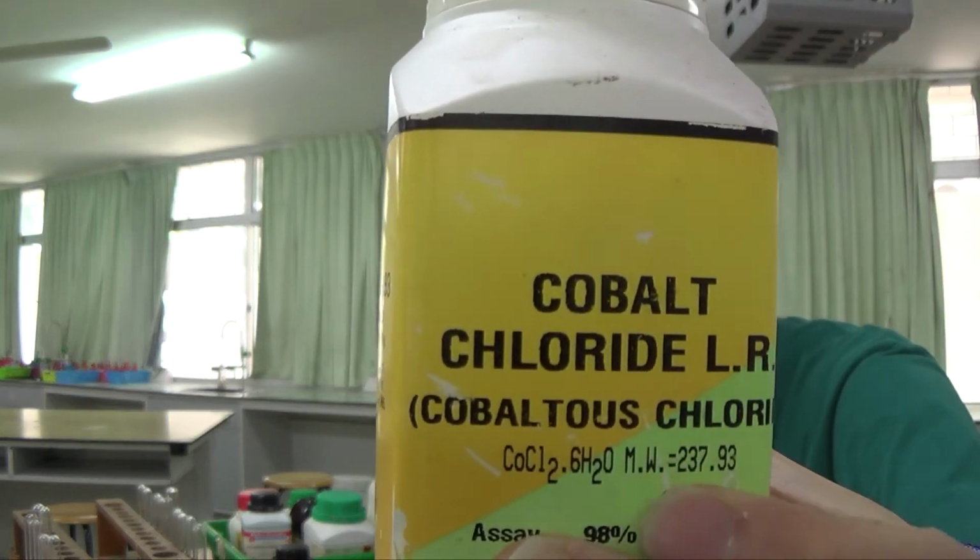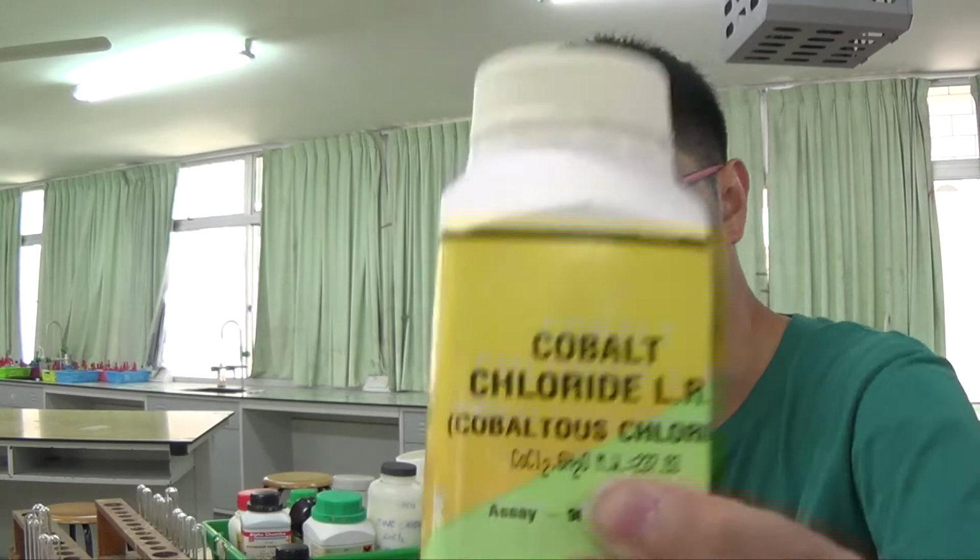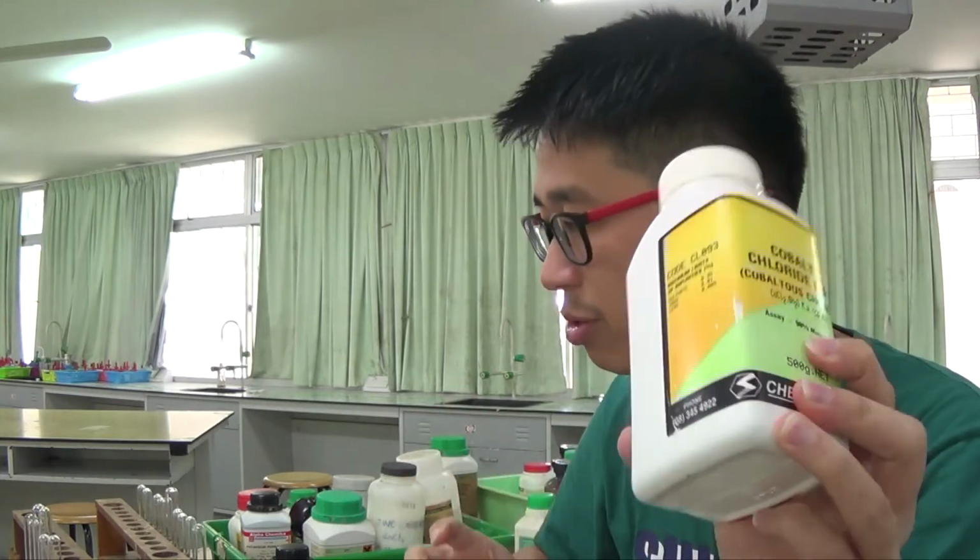Then the anhydrous cobalt chloride is what you coat the filter paper with, and it will be blue in color. And you test for the presence of water, which will turn this compound from blue to pink. So we use anhydrous cobalt chloride to test for water or water vapor, and it will turn from blue to pink, giving us back the hydrated form again.